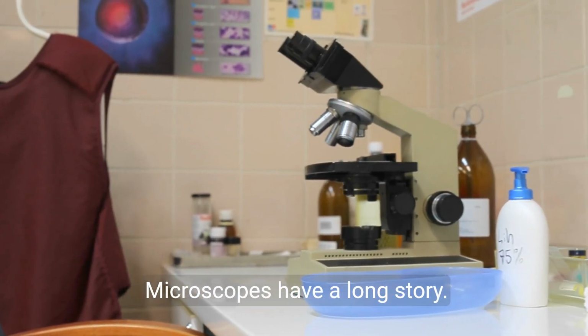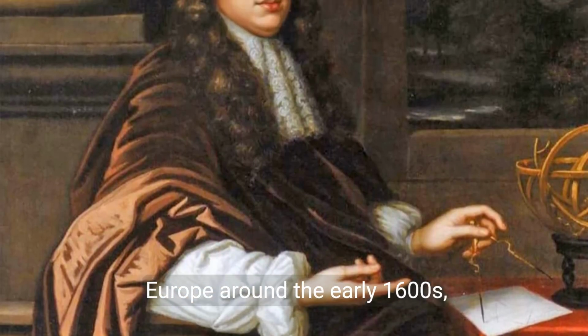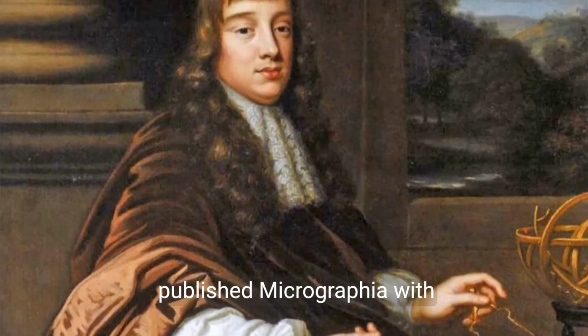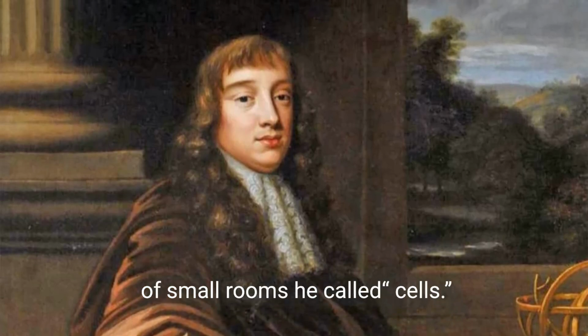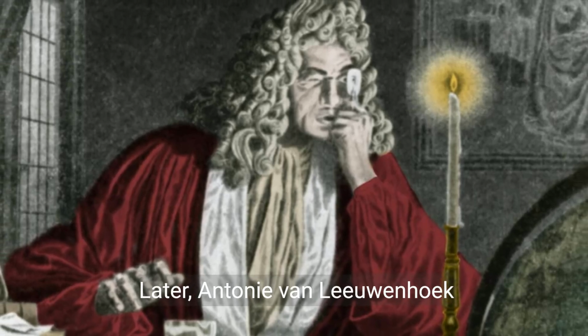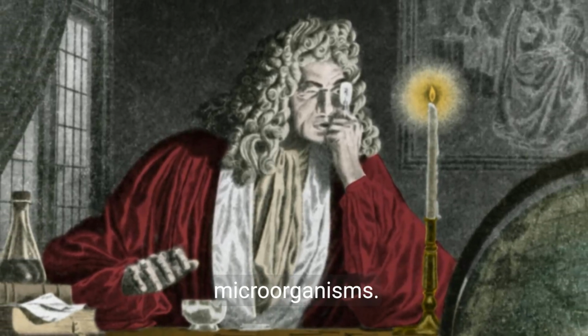Microscopes have a long story. Compound microscopes appeared in Europe around the early 1600s, and in 1665 Robert Hooke published Micrographia with drawings of tiny details, including cork, that reminded him of small rooms he called cells. Later, Antonie van Leeuwenhoek used strong single-lens microscopes to observe microorganisms.